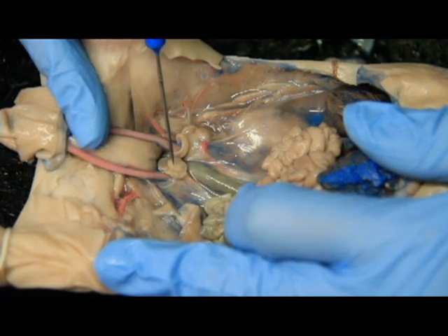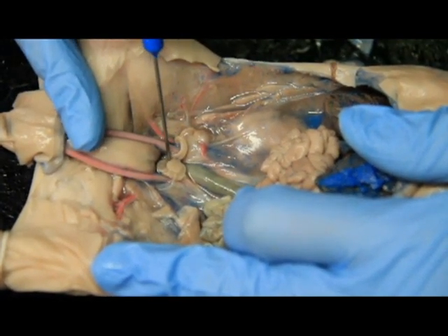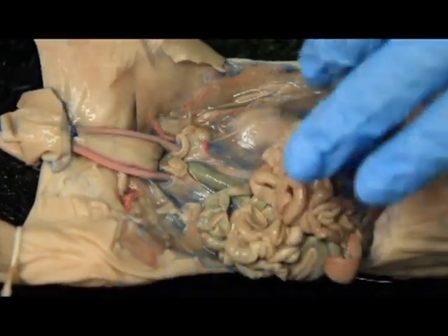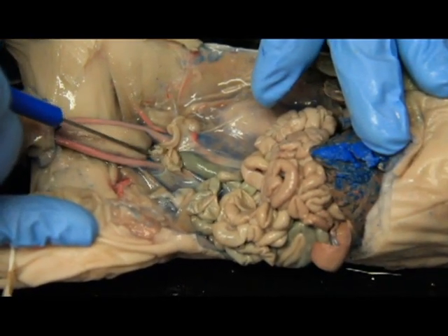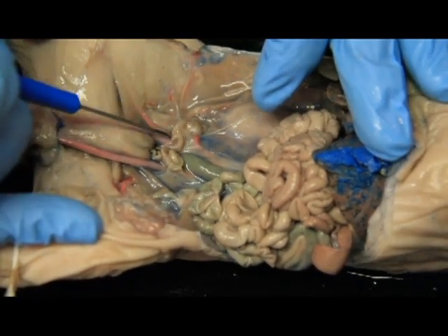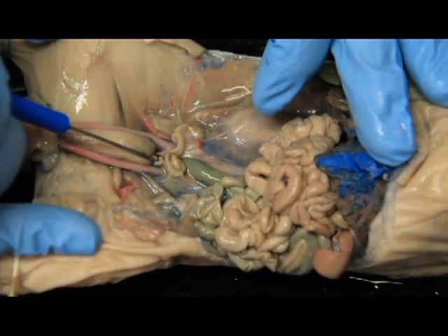Okay? So now in a male, that was a testis and an epididymis, but in a female, it is an ovary and an oviduct. Now, the branches of that Y, these squiggly lines that you see right here, these are the horns of the uterus. So the uterus is like that Y-shaped. These are the branches of the Y, these squiggly lines here.